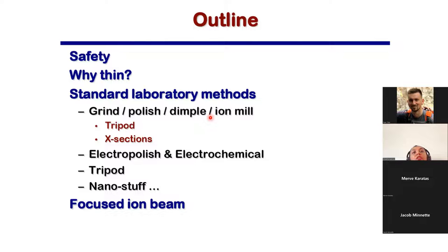And in your career, you will have to use all of them at certain point, depending upon the sample that you're studying. So does anyone have an idea about ion mill and tripod? I think Thomas, you have worked on it, right? No, I don't know too much about tripod specifically. I mean, I've done metal polishing before. I don't really know the specific difference though. Okay. And anyone else has heard about these techniques? Because you would be using them.